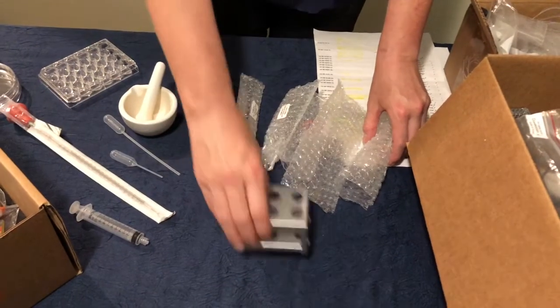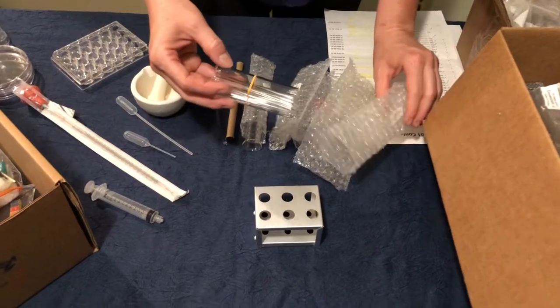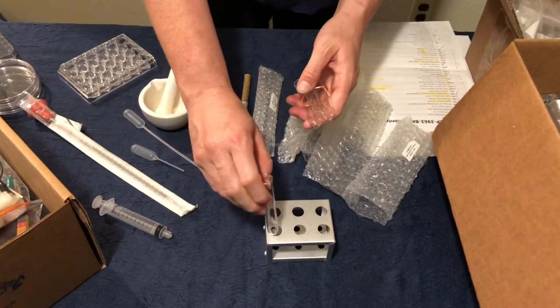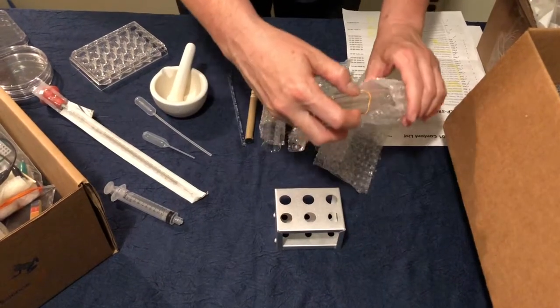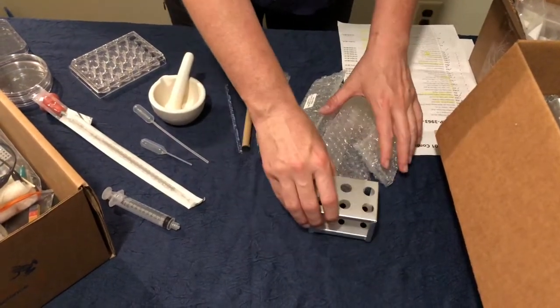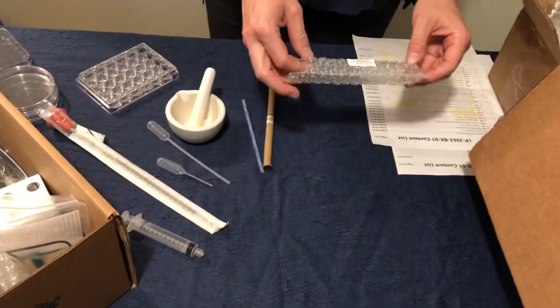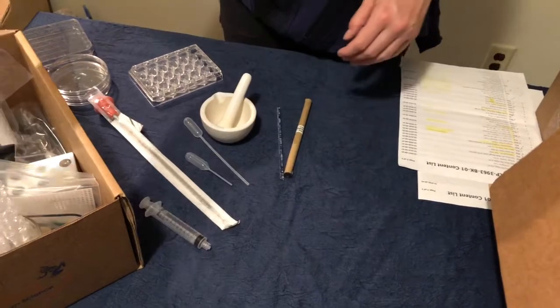Inside your kit you have a test tube rack. They have packaged the test tubes together in bubble wrap for different experiments — so you'll have, for example, five test tubes for one experiment all packaged together. I'll gently slide one out so you can see how test tubes fit into the little test tube rack. Keep these test tubes together; it's really nice to have all your supplies for an experiment already packaged together. We'll keep reusing the test tube rack, so don't throw anything away until the semester is completely over. There is also a very large test tube for a later experiment — keep that in the bubble wrap until you're ready to use it.